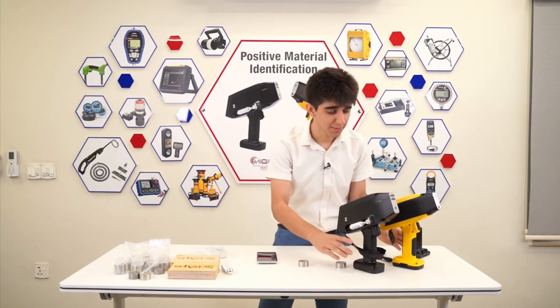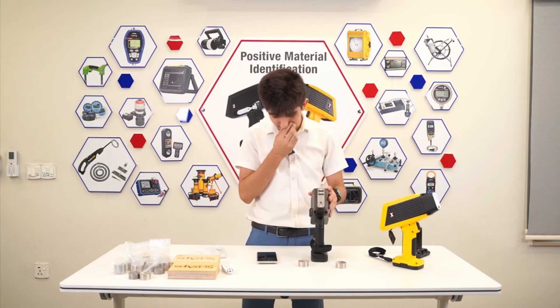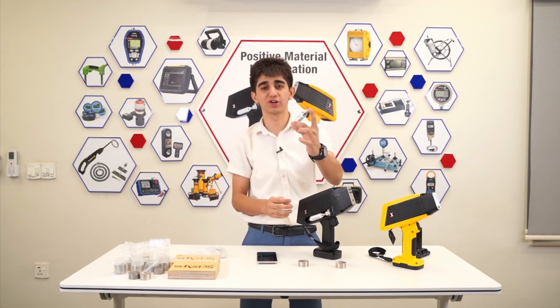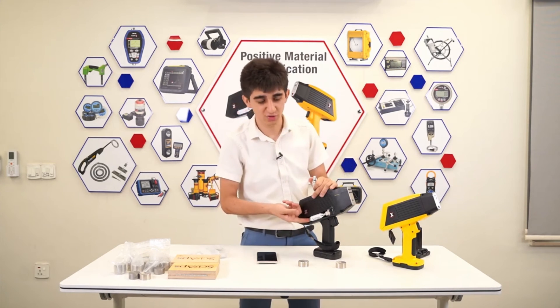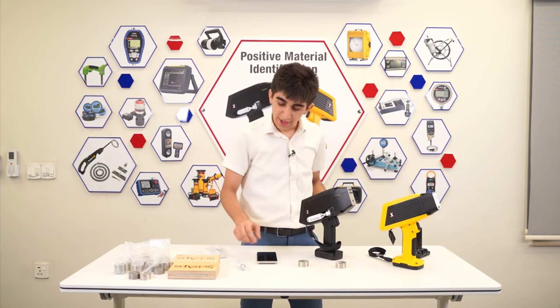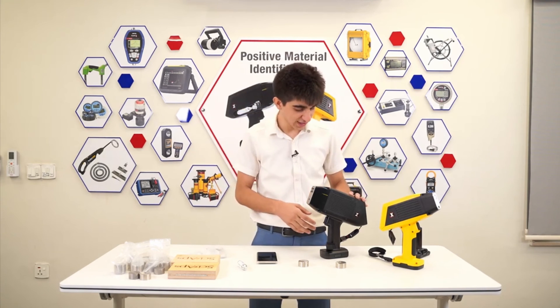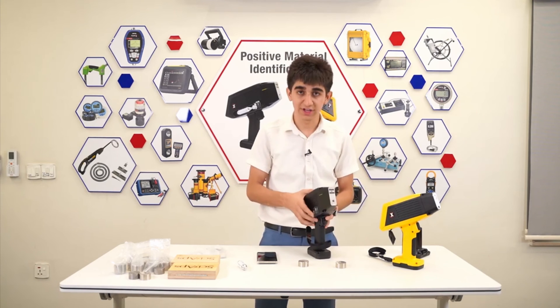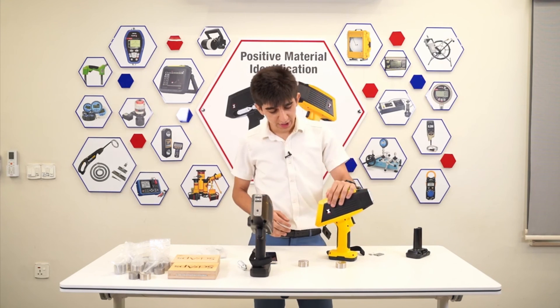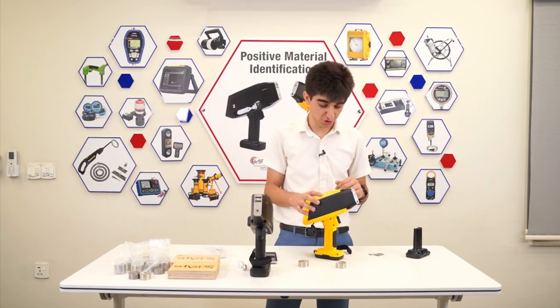Let's talk about the maintenance for the devices. For the Z902 LIBS device, the maintenance is basically replacing the argon cylinder. The replacement is pretty easy — you just pop it out, unscrew it, and put the new one in. Every once in a while, you can clean the lenses to remove dirt. For the X200 XRF technology, it's the same thing basically — just cleaning the unit and taking good care of it. Not a lot of maintenance required.